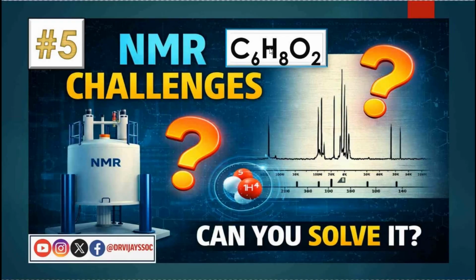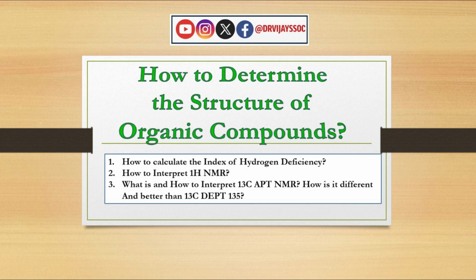So here is our fifth NMR challenge. We are going to determine the structure of this organic compound having molecular formula C6H8O2. While determining the structure of this organic compound, we are going to follow all those steps which we learned in the last videos. First we will calculate the index of hydrogen deficiency, then we will look at 1H NMR, and after that we will look at 13C APT NMR.